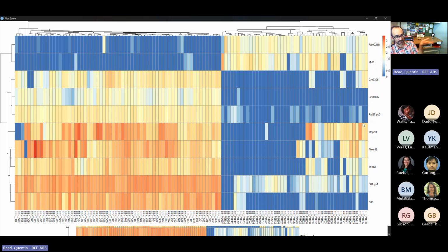It looks like certain genes have a higher level of expression in stem cells, and these ones have a higher expression not in the stem cells. And so even though it was an unsupervised method and we didn't tell the model which samples were stem cells and which were not, it seems to have pulled out an axis of variation that is explaining a lot of overall variance in the data that's associated with whether the cells were stem cells or not, or embryonic bodies, right?